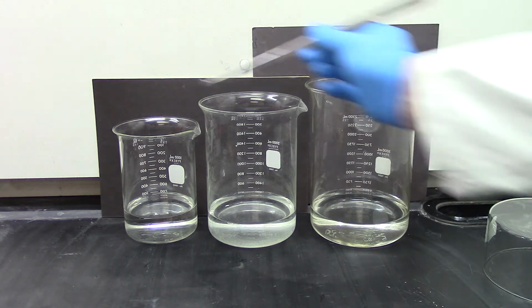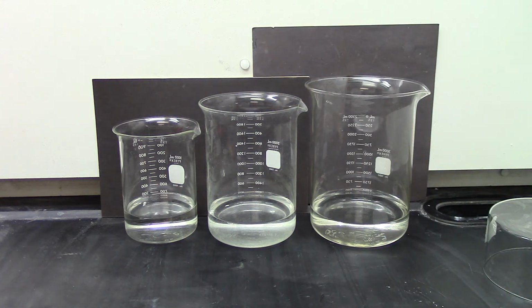Watch what happens when lithium is added to water. If you listen closely, you can hear a fizzing from the hydrogen being generated from the reaction, and you'll see that lithium is floating on top of the water, bubbling, there's some steam rising up from the heat, and the solution is slowly turning pink as it turns basic.